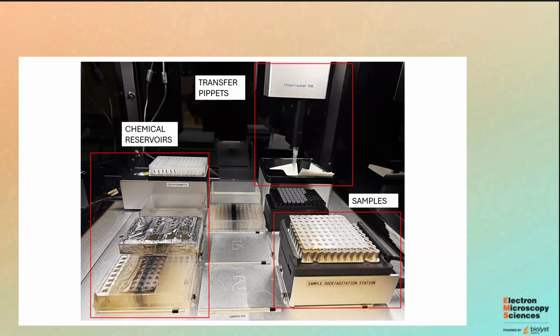Okay. I have one more question. Can you hear me? Do you treat uranyl acetate before discarding or before handing over to the outsourced people? Do you treat osmium tetroxide to neutralize it with any chemical?